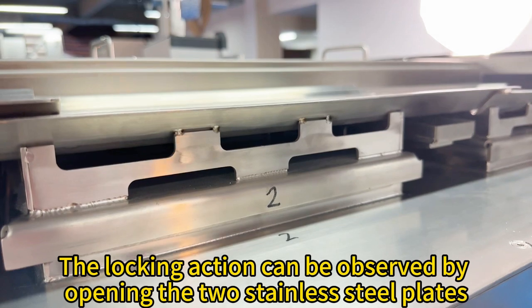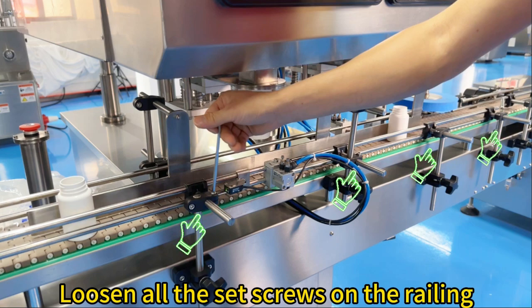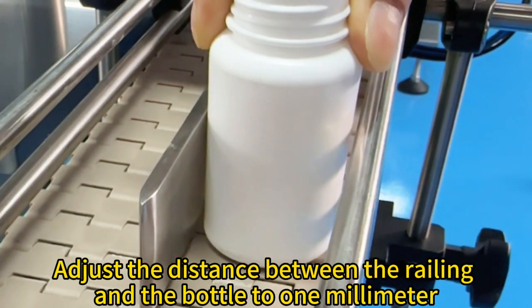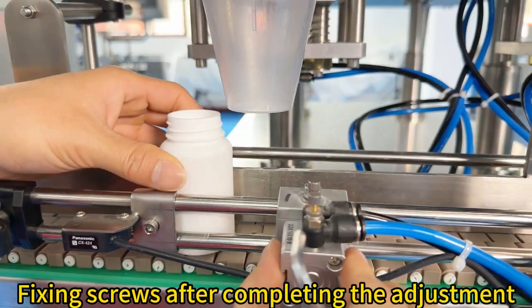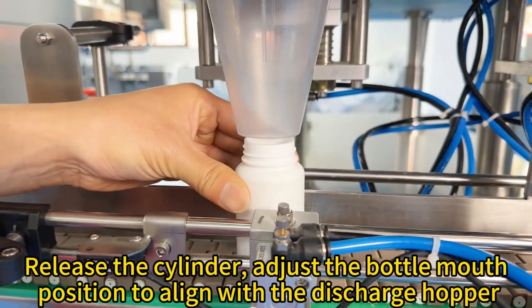Pin up to loosen, pin down to lock. Conveyor width adjustment: loosen all the set screws on the railing. Place one bottle on the left and one on the right, adjust the distance between the railing and the bottle to 1 mm, then fix the screws.